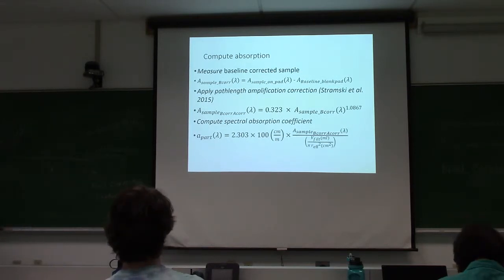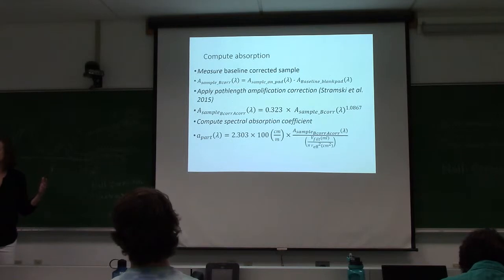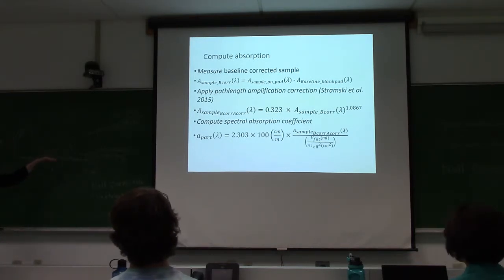You figure out what this value is, and you subtract from the whole spectrum. And that's constant for the whole spectrum? Well, I don't know. What do you think? Probably. To first order, because the filters are white and scatter pretty much equally in all directions, it's not a bad assumption for phytoplankton on filter pads in transmission mode. It's not perfect.